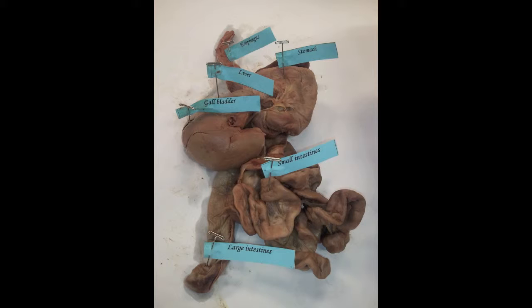Most of the absorption of food takes place in the small intestine. The large intestine absorbs water from the remaining indigestible food matter. It then uses muscular contractions to pass remaining useless materials from the body.